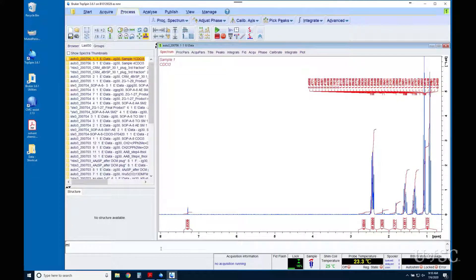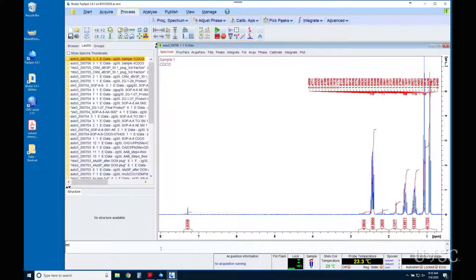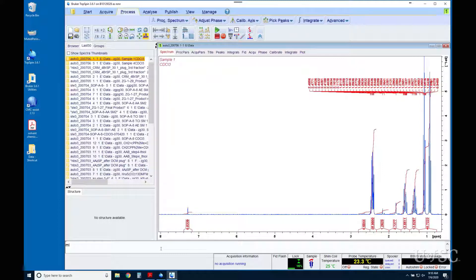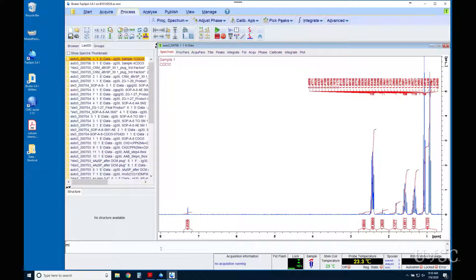The output of ICON NMR goes through an automated processing that includes correcting the phase of the results. It is usually pretty good and for most results will not have to be further optimized. However, there are datasets that the software will have problems with, and you should be familiar with the steps to phase data correctly.